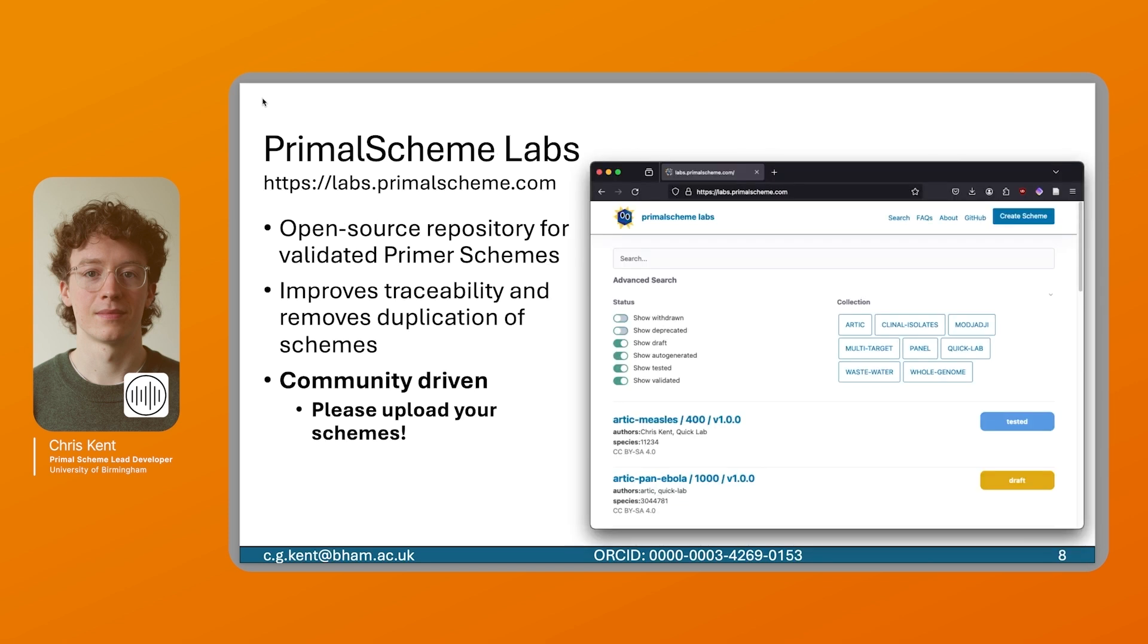I'd also like to talk to you about Primal Scheme Labs. This is an open source repository for validated primer schemes. We designed this to improve traceability and remove duplication of this work done on generating schemes. So if you have a project which needs to sequence measles or COVID, rather than designing your own scheme you can search on Primal Scheme Labs to find a curated and already tested scheme. This is community driven, so if you have a scheme that works please upload it and share it so other people can use it and accredit you for it.